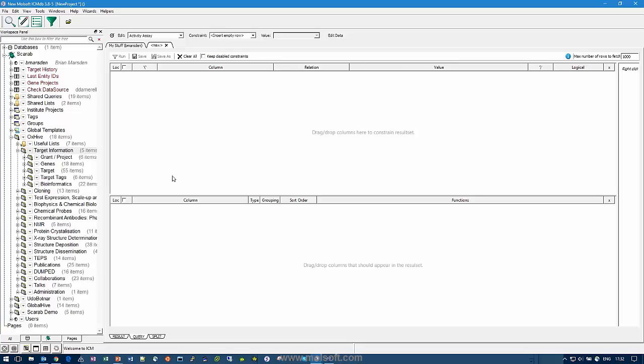So what I'm first going to do is come up with a number of targets, or list all the targets to start with, CDK for example. And you can imagine, those of you who know kinases, the sorts of things that you expect to see.